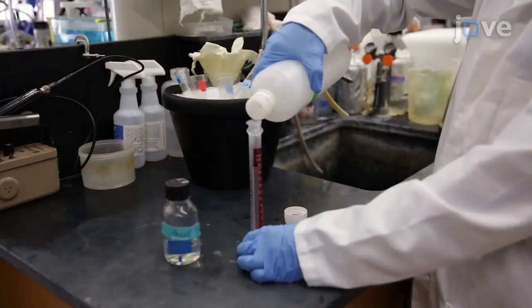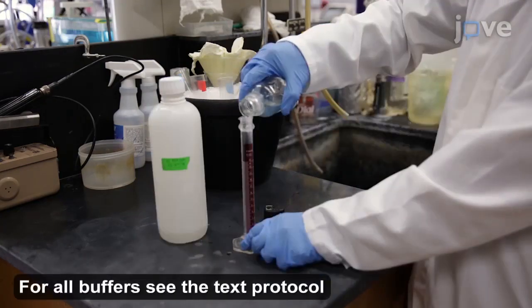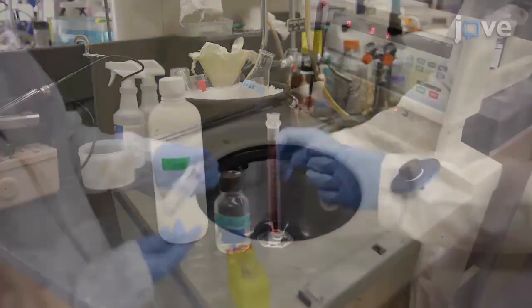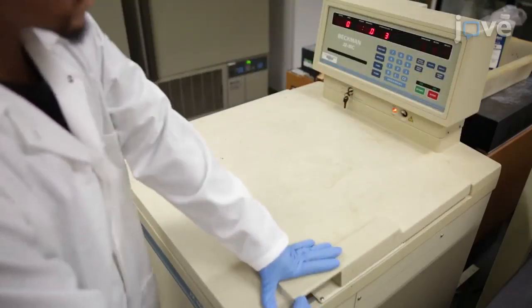On the day of chloroplast isolation, prepare a continuous density gradient by centrifuging a mixture of 15 milliliters of Percoll and 15 milliliters of 2xGB buffer in a 50 milliliter polycarbonate high-speed centrifuge tube at 30,900 Gs in a fixed-angle rotor for 30 minutes at 4 degrees Celsius with the brake off.